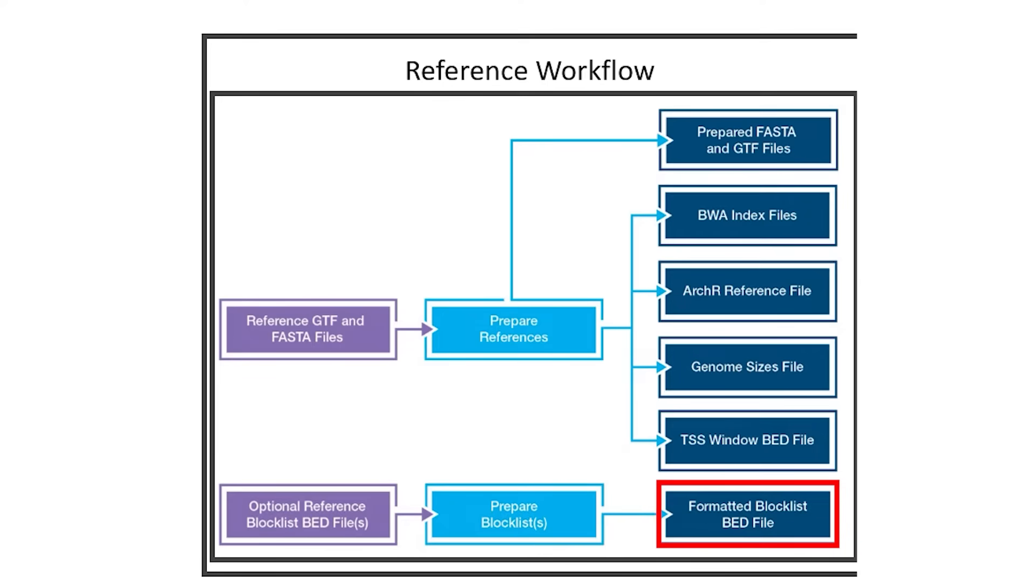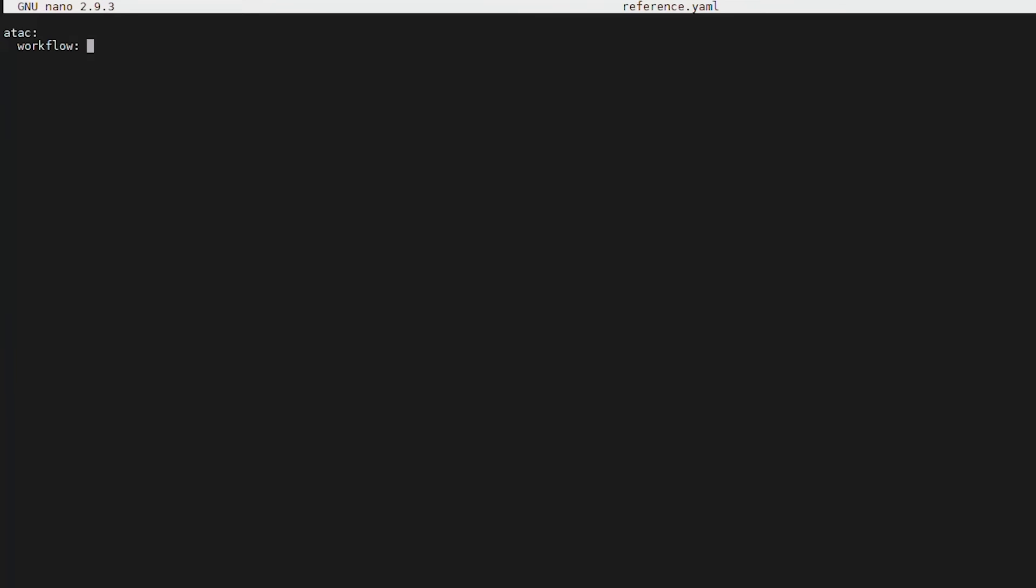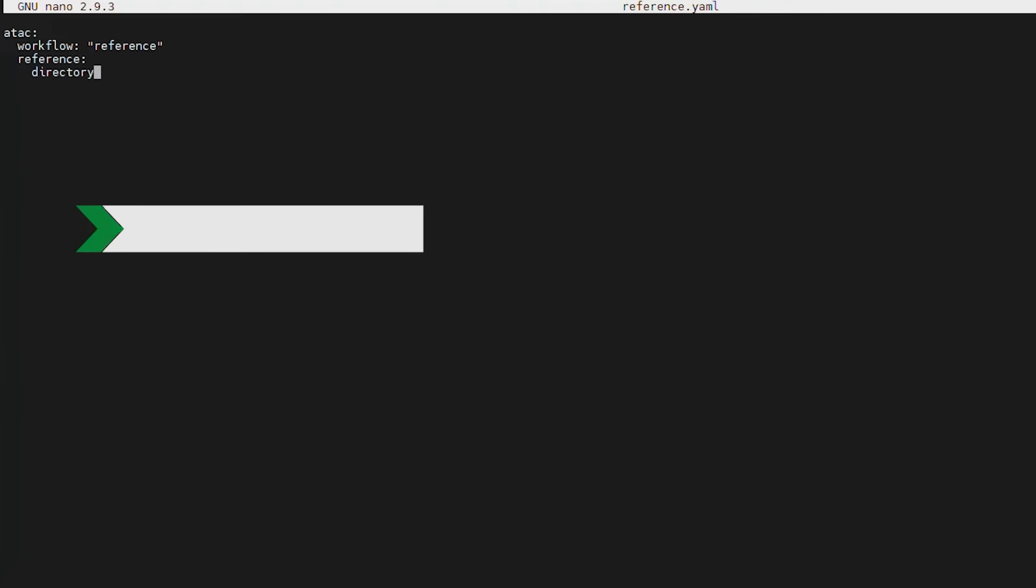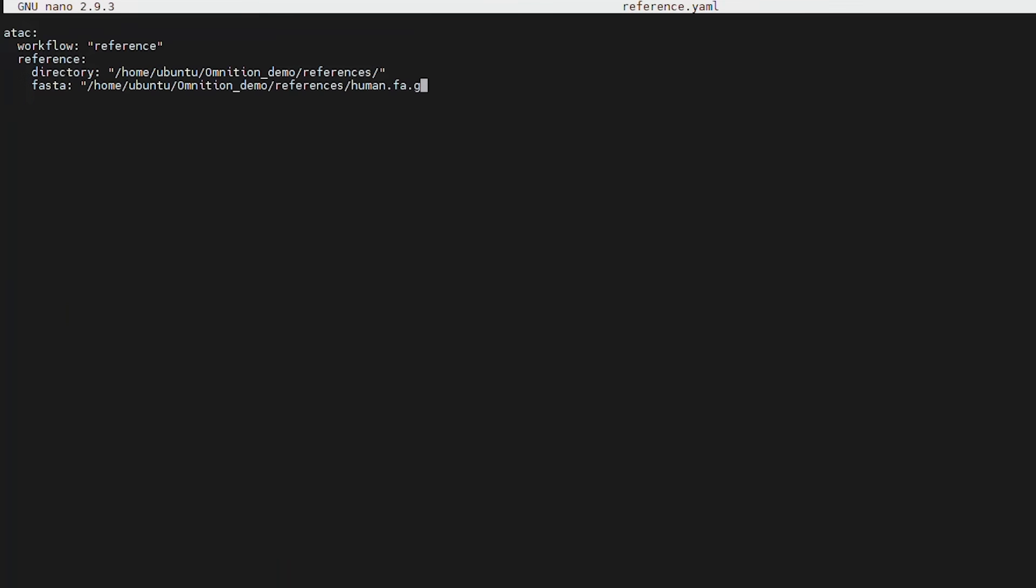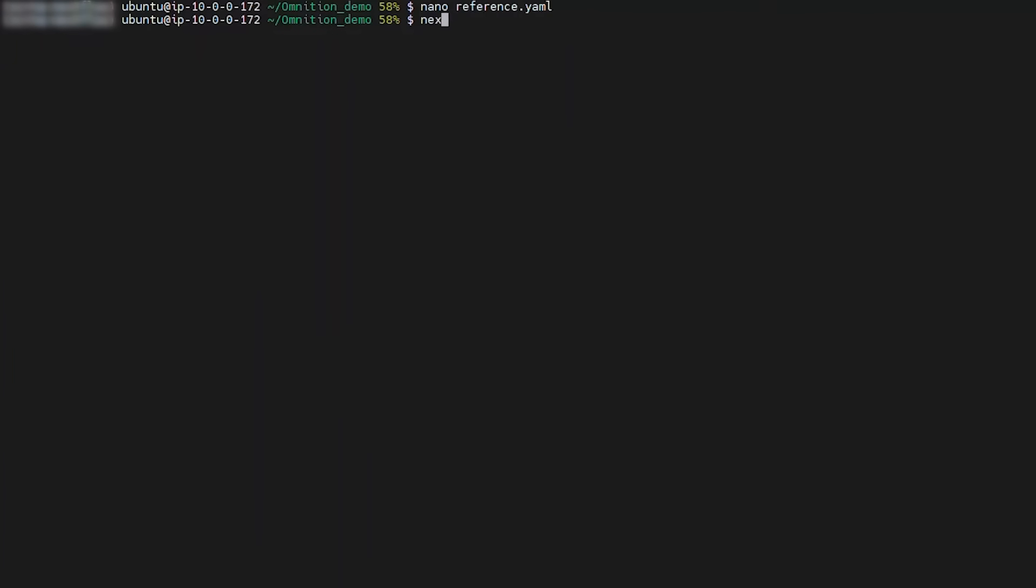The YAML file specifies which workflow the user is running. It also contains the path to each of the required input files. To save the YAML file, simply name the file and include .yaml at the end. Here we name the file reference.yaml.